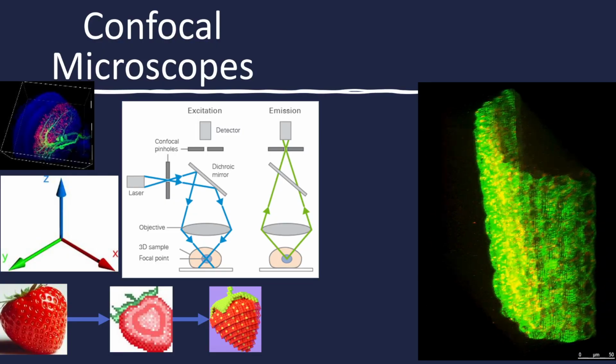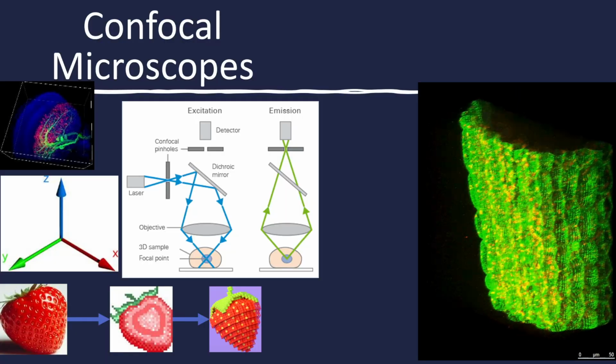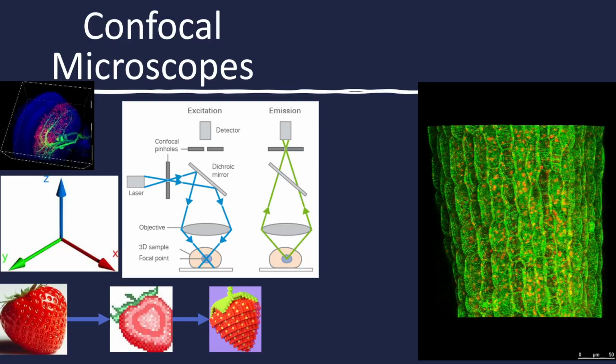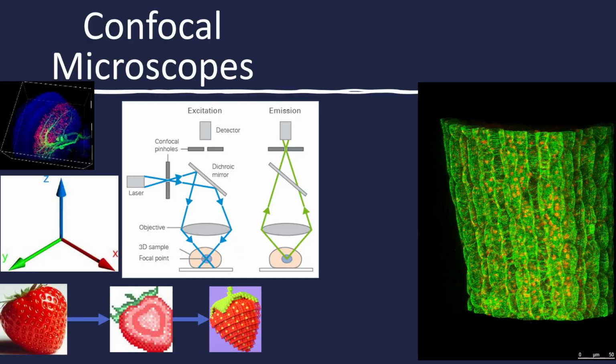In confocal microscopy, a laser scans the sample point by point to digitize sharp optical slices. A computer then uses those data points to build a 3D view of subcellular structures, much like rendering a video game model, pixel by pixel.